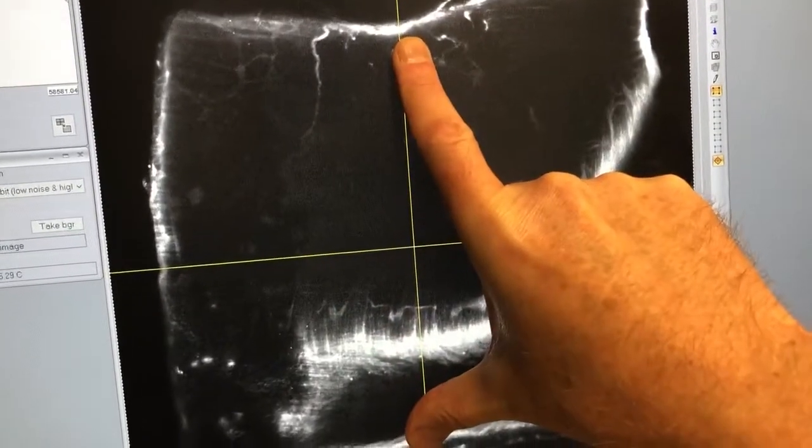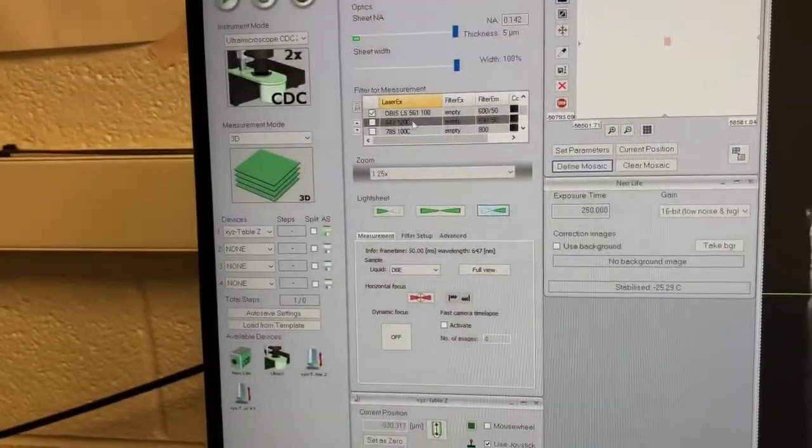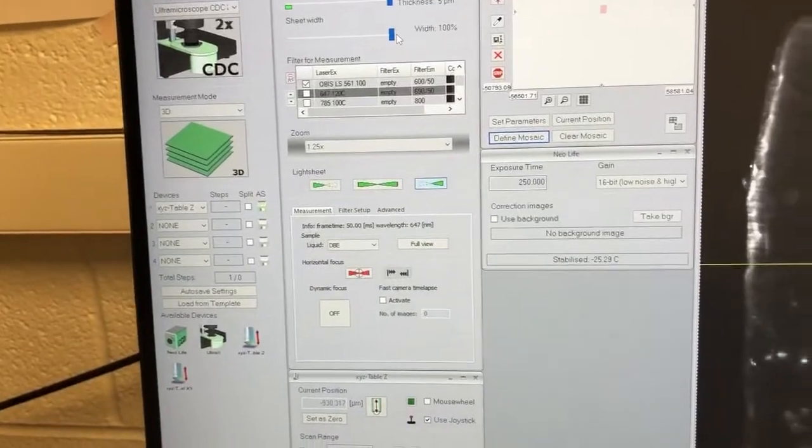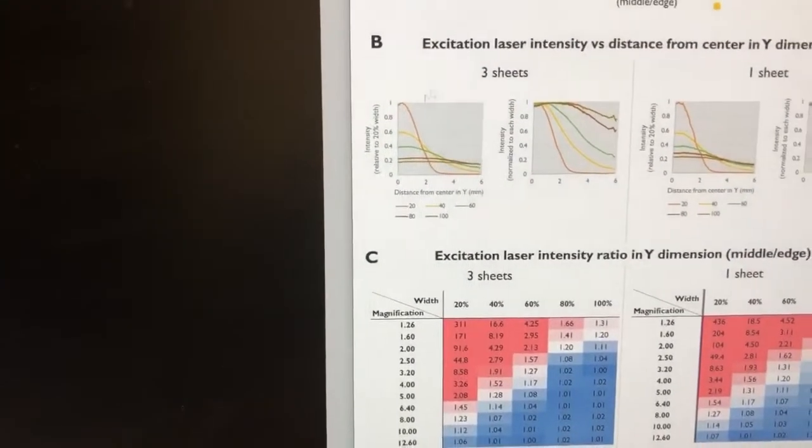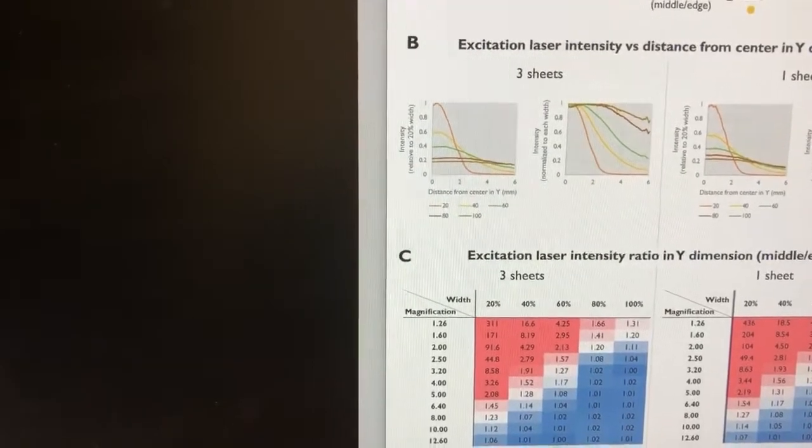Now if you extend the width, that flattens out. So that's shown here - for example, these are measurements of the intensity in the middle towards the side.